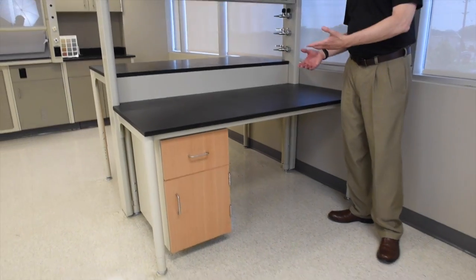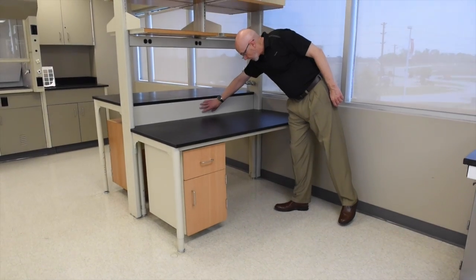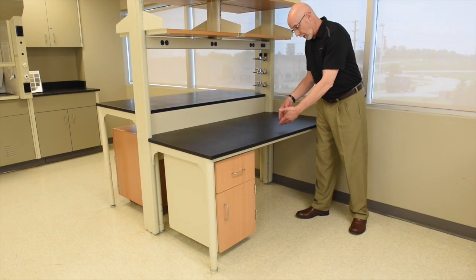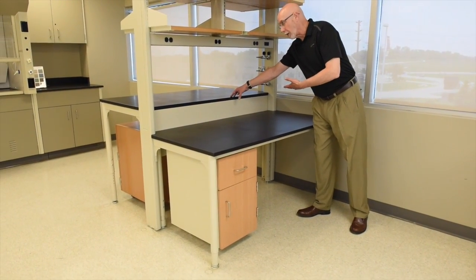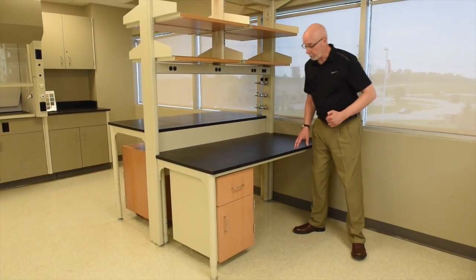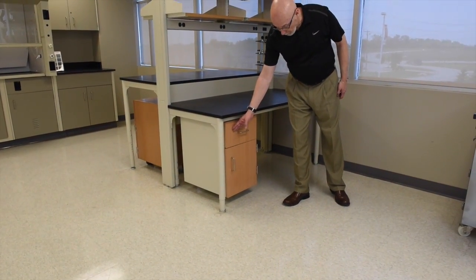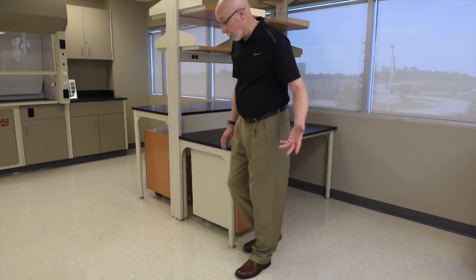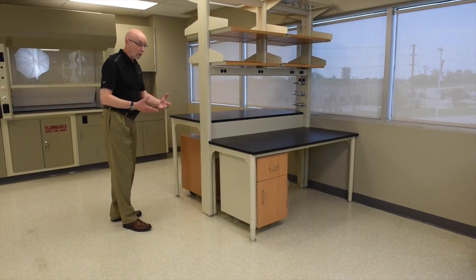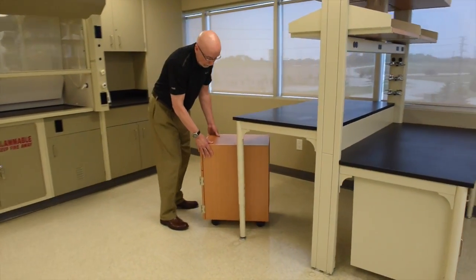So we think it's the most flexible, adaptable unit out there. Also notice this right here — we extend part of the table frame down so that when you have a sitting height table adjacent to a standing height table, you have this here as a backstop to keep things from rolling off. It's made to be used with suspended cabinets which, with the Mott attachment system, can be moved left to right with a little bit of work — not on wheels, but it certainly can be done. Or you can just utilize a mobile pedestal cabinet.